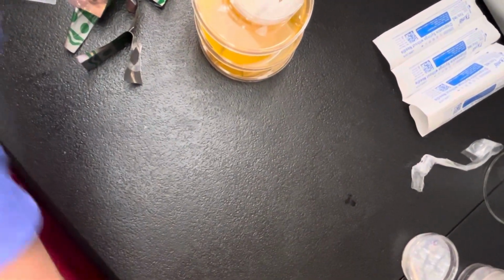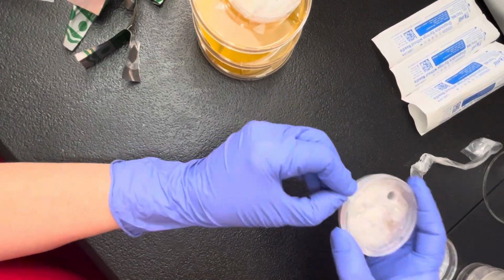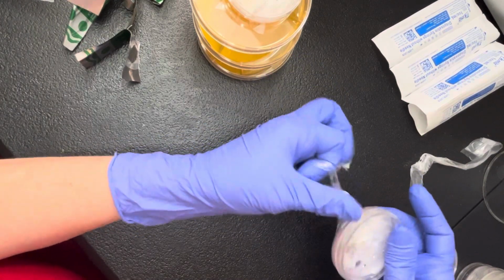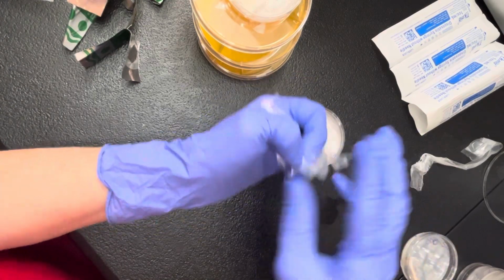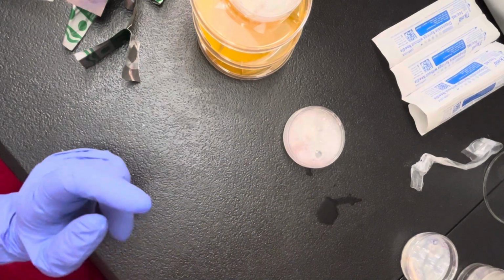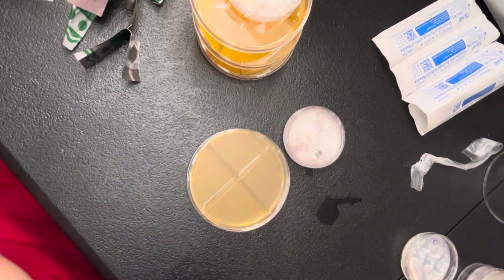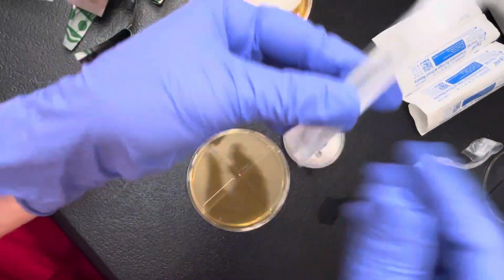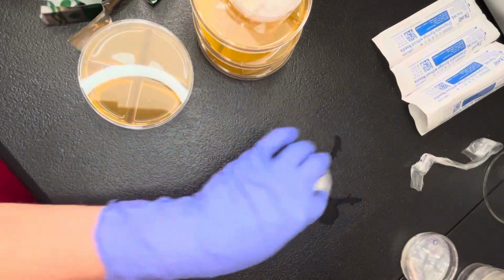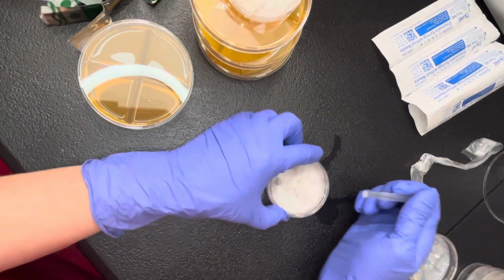So, here is a good one. This one looks like it has a little bit of slime on it. It's an old plate. It's just too much moisture, drying out on the edges, too much moisture in the center. I want to show you how I do a transfer on a plate that I feel like is contaminated, because I don't take a cut of it. What I like to do is take a fresh needle, like literally a syringe needle, and I'm just going to try to isolate some mycelium with this, without picking up agar.